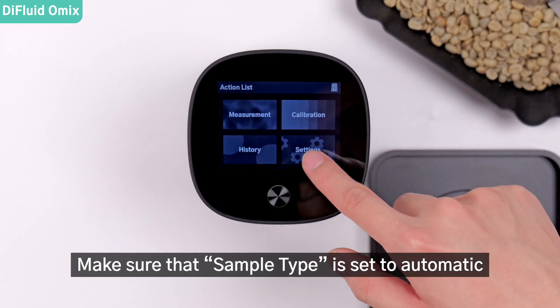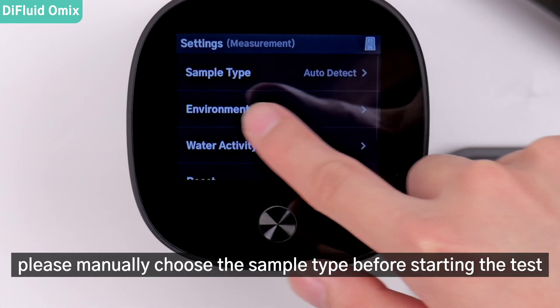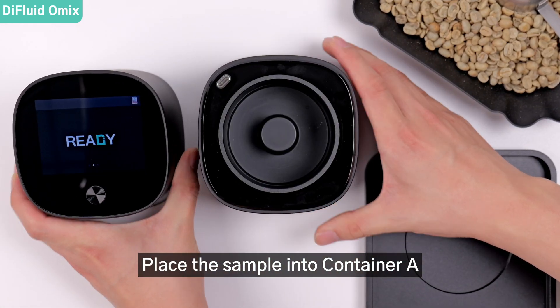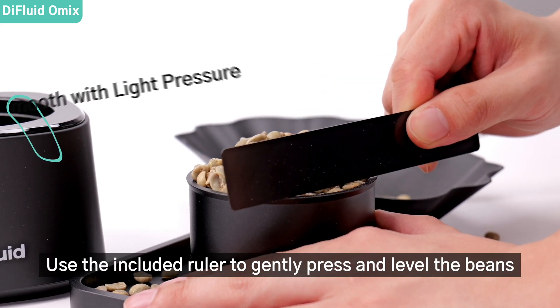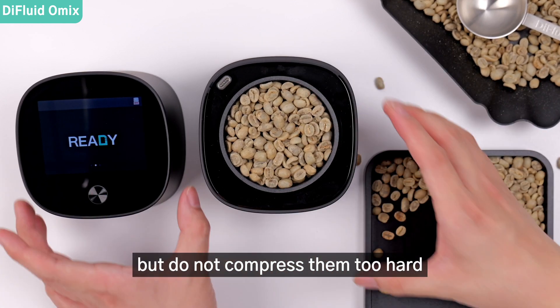Make sure that sample type is set to automatic. If not selected, please manually choose the sample type before starting the test. Place the sample into container A, ensuring that the surface of the beans is level with the edge of the container. Use the included ruler to gently press and level the beans, but do not compress them too hard.